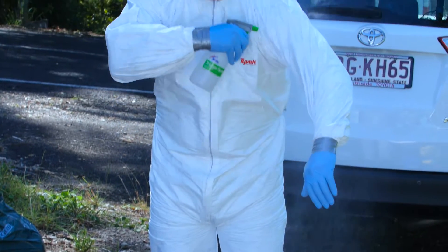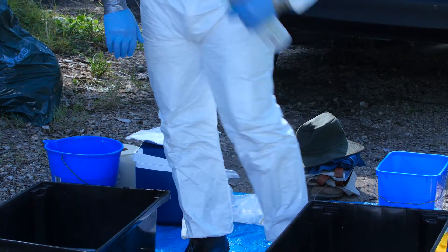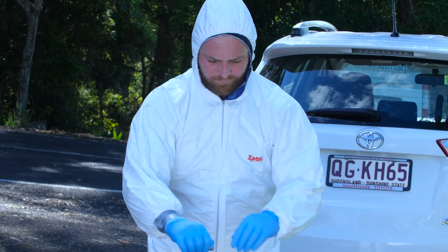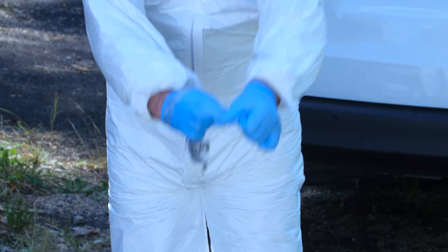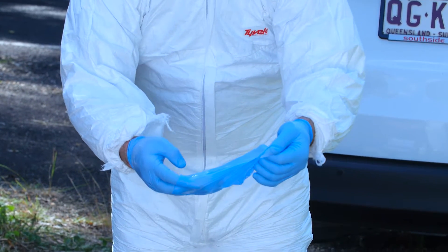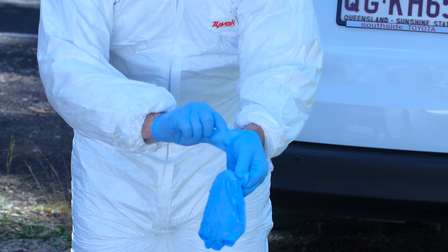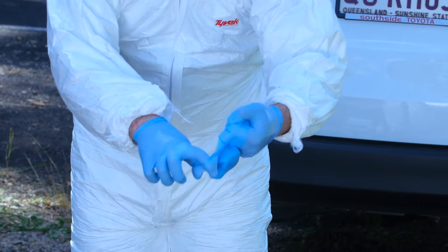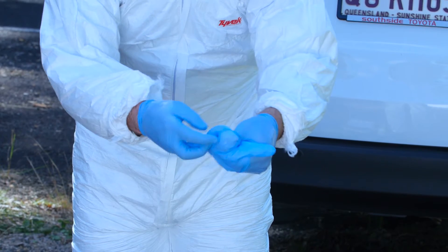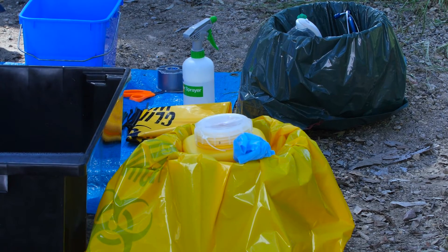Mist your outer layer of disposable overalls or waterproof gear with disinfectant such as Vercon prior to removal. If you're wearing a hat, soak it in the disinfectant tub, then place it in the equipment bag for reusable equipment. Remove duct tape from overall sleeves, then remove the outer gloves by turning them inside out. After removing the first glove, slip one finger inside the outer glove on the other hand to avoid touching the contaminated side. Turn this glove inside out as well, leaving the first glove rolled up inside the second. Dispose of gloves by placing in a biohazard bag on the dirty side.